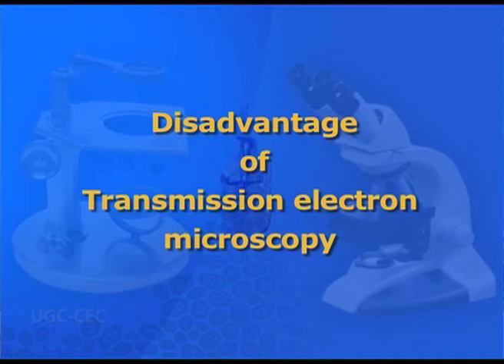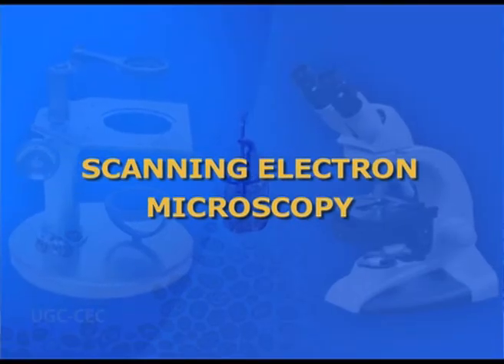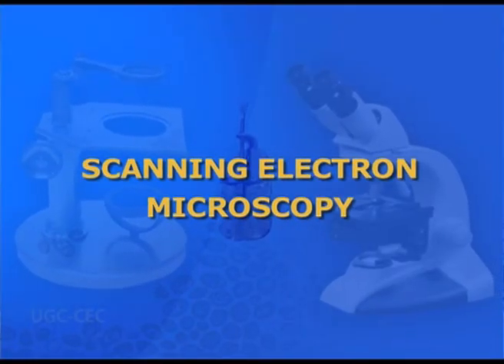Disadvantages of transmission electron microscopy. The major disadvantage of transmission electron microscopy is that it demands ultra thin sections, and because of that, transmission electron microscopy is one of the costliest protocols in microscopy. Now let's talk about scanning electron microscopy.